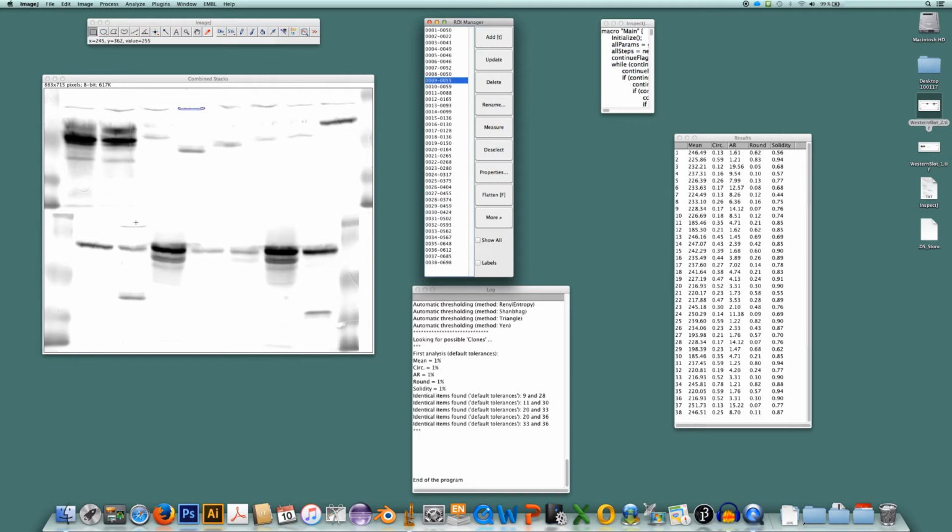So someone has copied and pasted, most likely, this object here onto this Western blot. So let's outline them. Okay, I just take it to here and here.